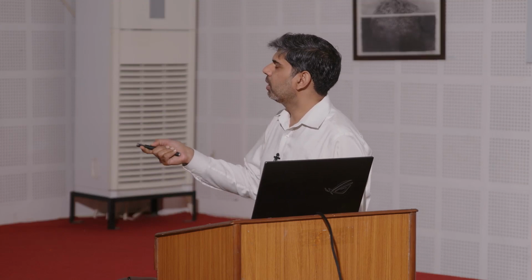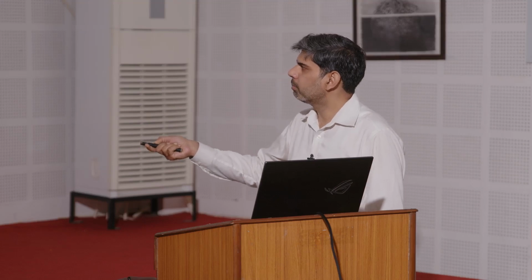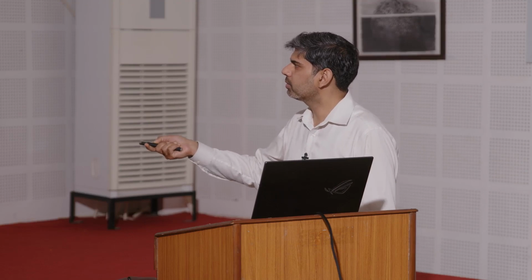Now, what we do is that we apply voltage. What is going to happen? These ions are going to move under the effect of the electric field, but all of them are not going to move at the same speed. They have different mobility. Positive ions will have positive mobility, negative ions will have negative mobility, but when I say mobility is higher or lower, I am just talking about the absolute values. S1 has higher mobility, so the zone of sample S1 races ahead, whereas S2 remains behind.